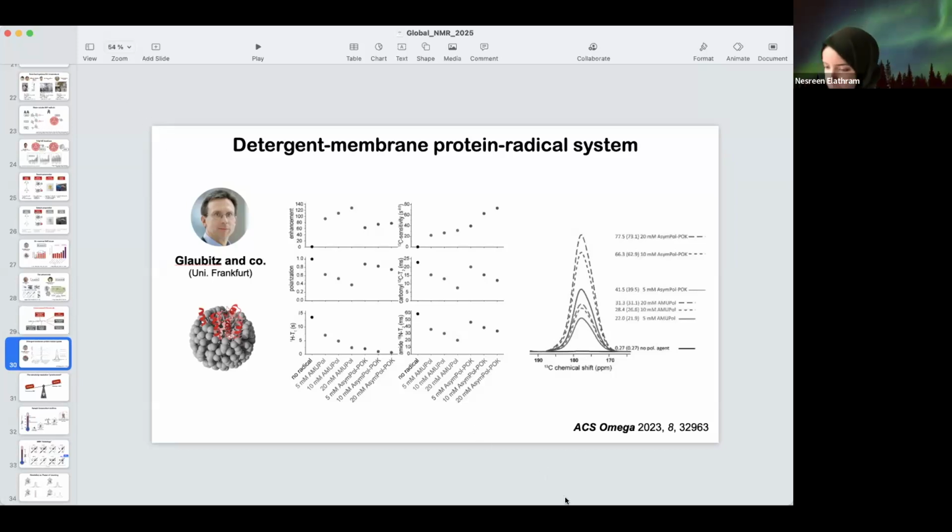One more question from us. How can we know when glycerol destroyed our sample or not? Oh, that is the point. You have to measure something different. For example, on cells, you know the viability, right? On a protein, you measure the activity. For example, if it's an enzyme, you can do the enzymatic assay. On a receptor, we can do the ligand binding assay and some other assays.